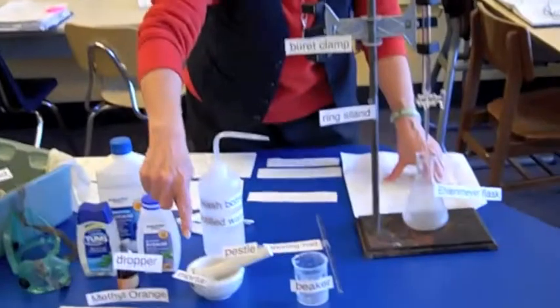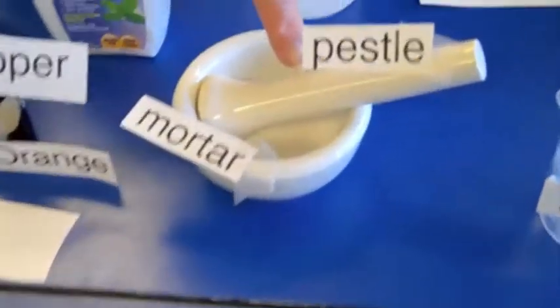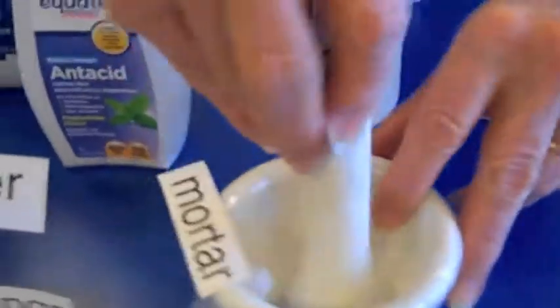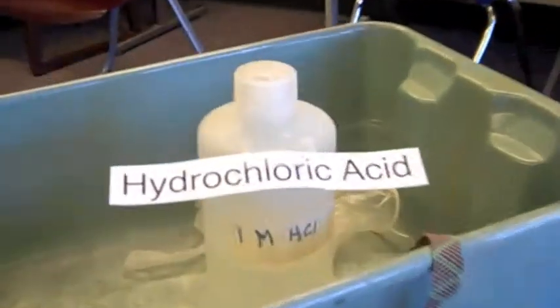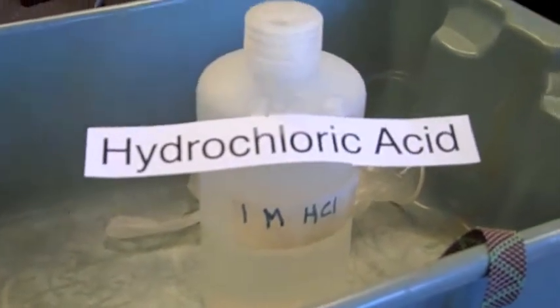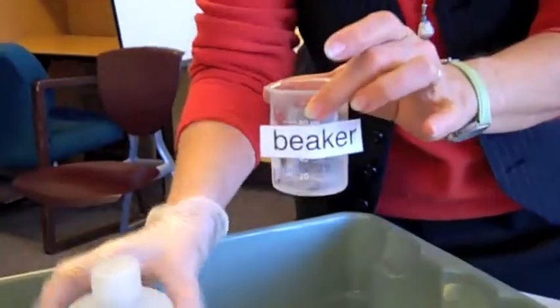Okay, so more on the equipment. Besides the burette, going in order, you need a mortar and a pestle. This will be what you use to grind up your antacid tablet. You'll grind it up as well as possible. You will also need 60 mils of hydrochloric acid. This is a strong acid, so use gloves when you're pouring it. You're going to be pouring it into a beaker.